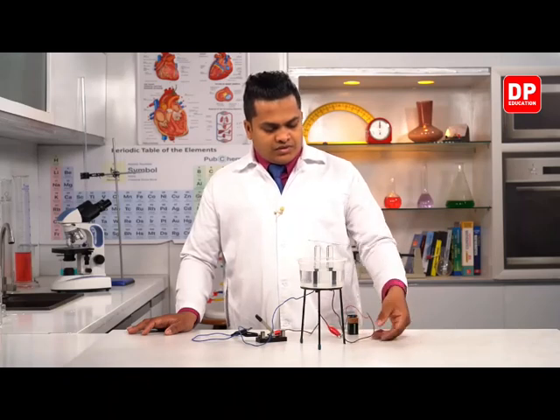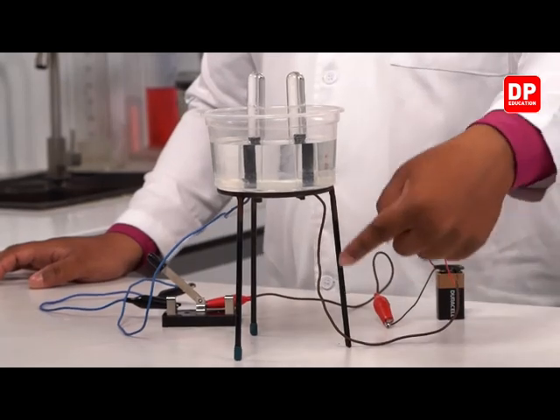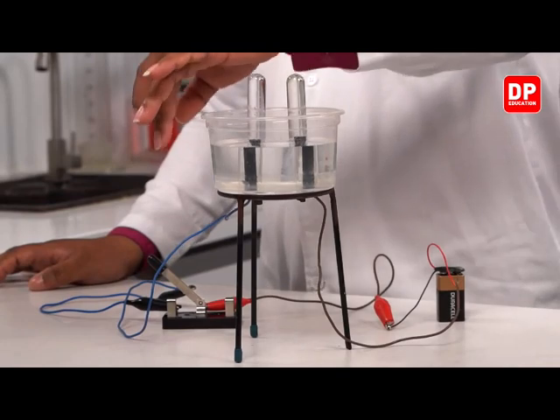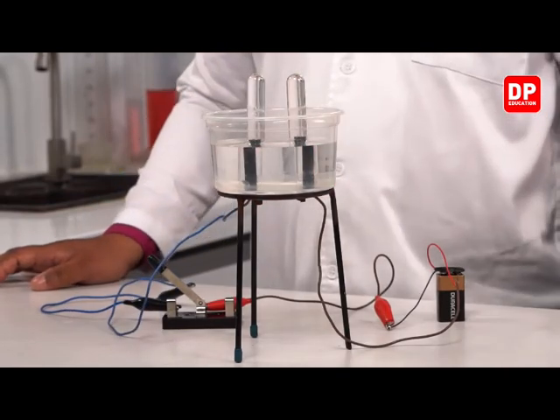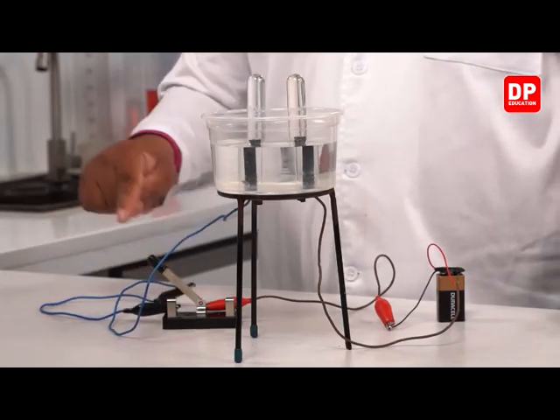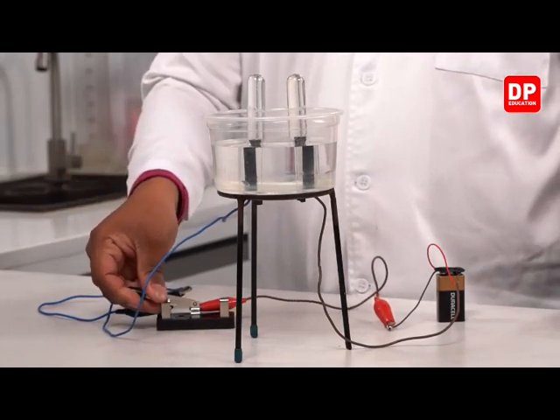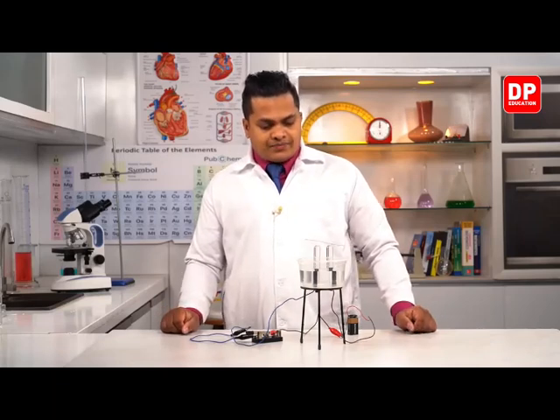This brown color one indicates the positive terminal. This is the positive terminal. This is the negative terminal over here, which is indicated by blue color. So this is the negative terminal or the negative electrode. Now let's turn on the switch and we'll observe what's going to happen.